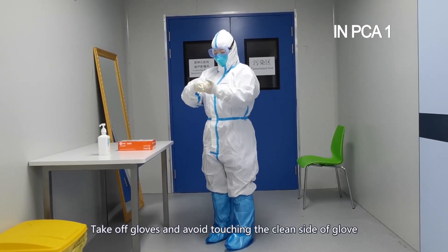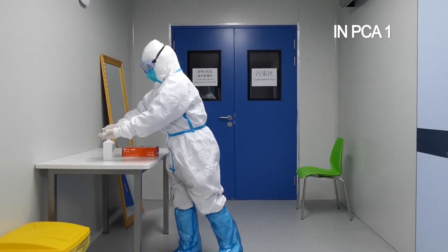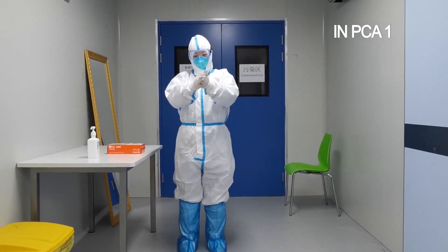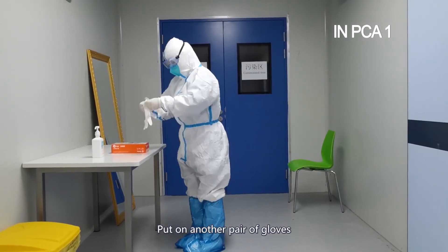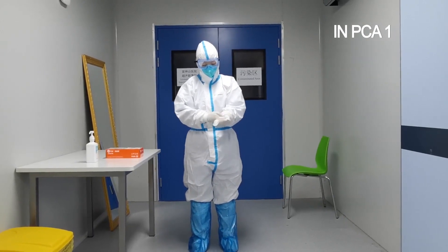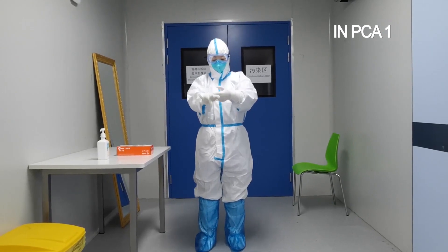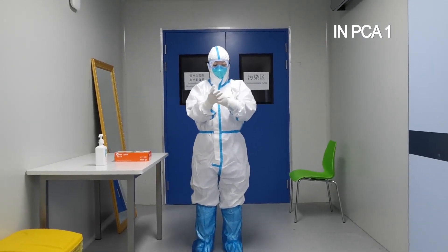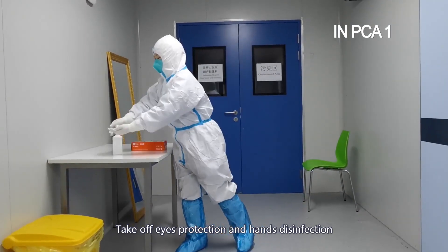Hands disinfection. Take off gloves and avoid touching the clean side of gloves. Put on another pair of gloves. Take off eye protection and perform hands disinfection.